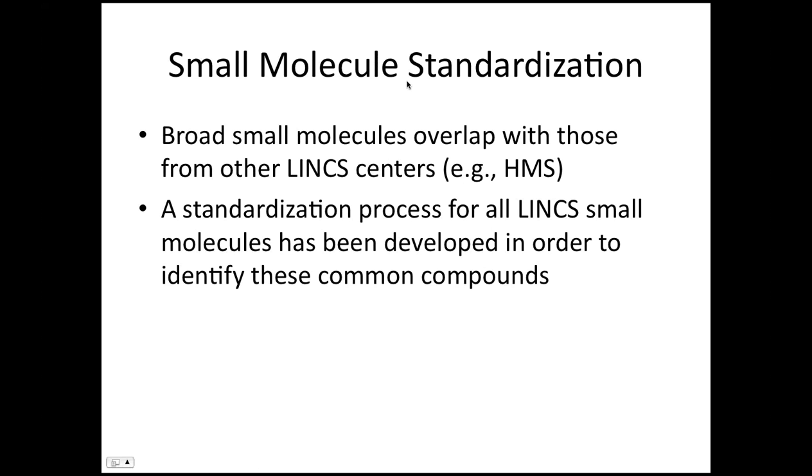So this is how we do the standardization. What we have just mentioned is how we are doing small molecule standardization. There are some small molecules that are in Broad as well as in other LINCS centers like HMS, right? The standardization process for all small molecules has been developed in order to find the common compounds between centers.